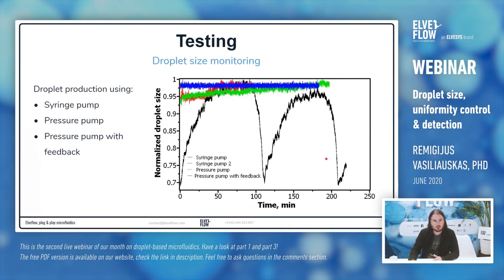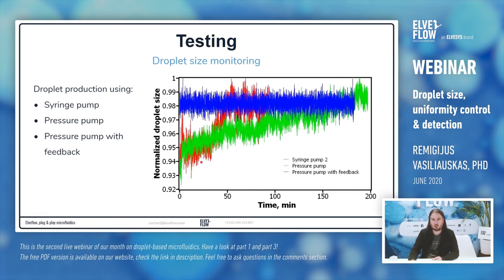We've done tests comparing syringe pump, pressure pump, and pressure pump with feedback. With a syringe pump started immediately, the variation in droplet size is really big — shown by the black line — and this is not optimal. If you wait about two hours for the syringe pump to stabilize, the red line is already much better. But not everyone can wait two hours, especially in labs where droplet production is only 30 to 50 minutes.